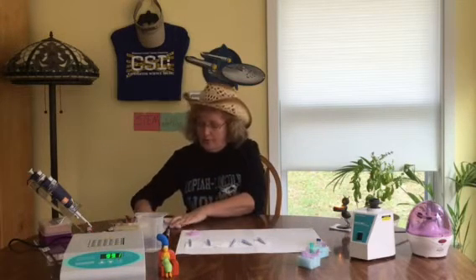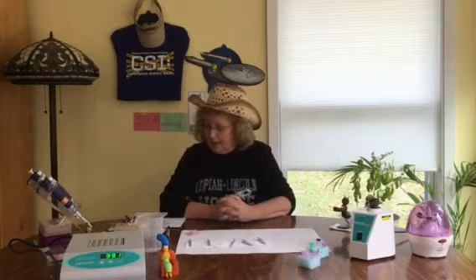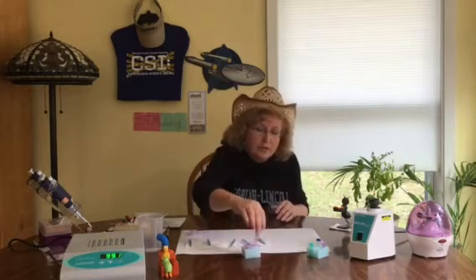Okay, so in video 2 we went through step 5, so for video 3 we pick up with the protocol step 6 and we'll go through 11. So if you're looking at step number 6 on your protocol, it says to macerate your insect in the distilled water.